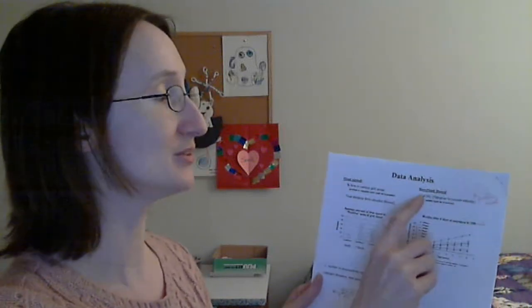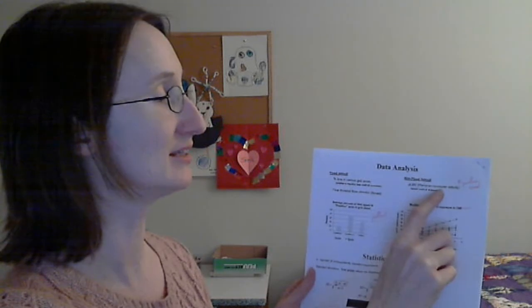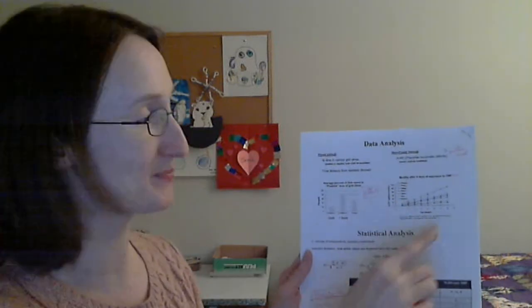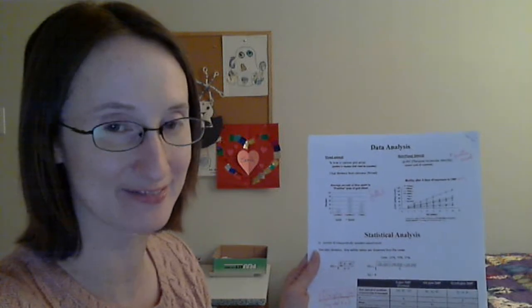So if you're doing a non-fixed stimuli, I recommend that you do something called PLMV, which stands for Planaria locomotor velocity. It sounds pretty scientific. All it is is the number of grid lines that were crossed. It's kind of funny because I wanted to show you that I didn't just make this one up. So this is a figure from a research article where they're measuring PMLV.